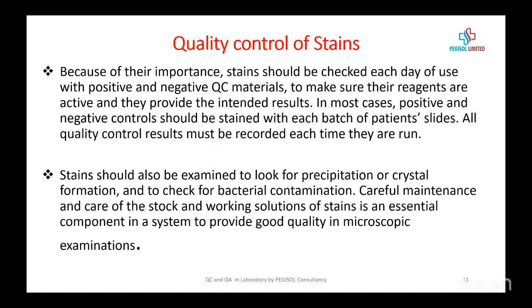All these are many stains. Because of their importance, these stains should be checked daily with positive and negative QC materials to make sure that the reagents are active. Because if the stains are not quality controlled, you're going to give false results. Stains should also be examined for precipitation or crystal formation and checked for bacterial contamination. Carefully maintain and care for the stock.